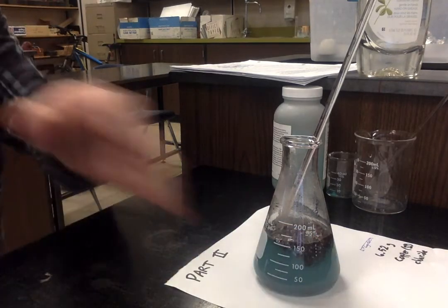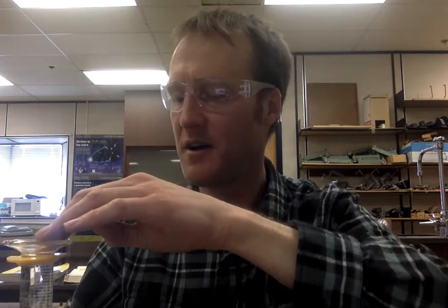That is everything that I was going to cover in the regular part of the lab. I would like to try something one more time, and that is I'd like to try making the gas one more time because it's kind of a fun demonstration if it works. So I think it was a mistake using the detergent. It works for other settings, but it didn't work here. For simplicity, I'm just going to add this to the beaker with the zinc in it.